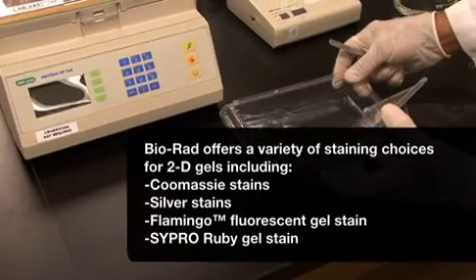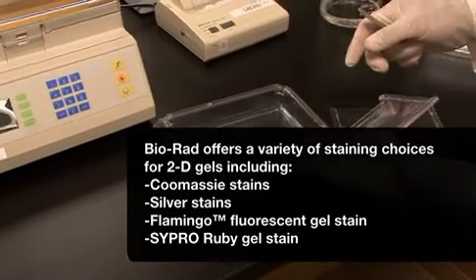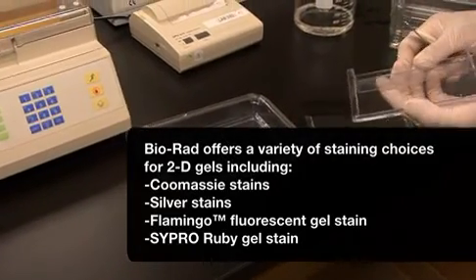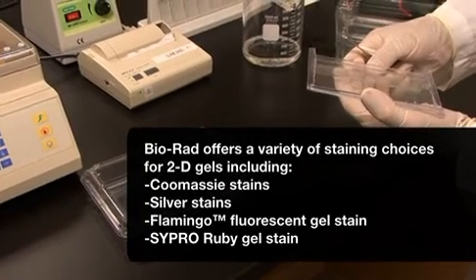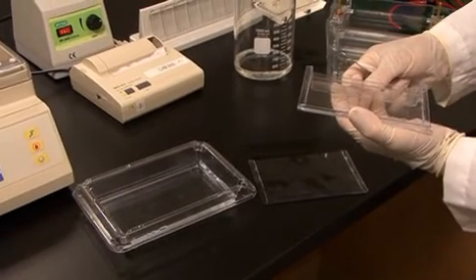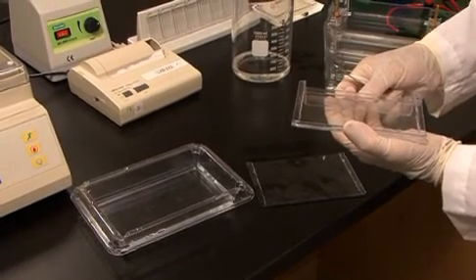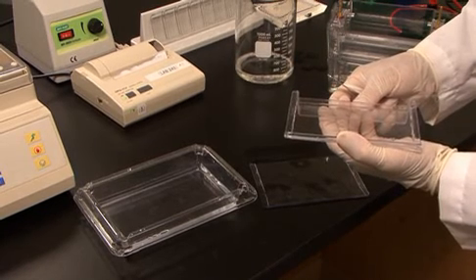Bio-Rad offers many different staining choices for 2D gels, ranging from the visual stains, the traditional Coomassie and silver stains, to the fluorescent stains, Flamingo and Sypro. In this case, I am staining this gel with Bio-Safe Coomassie. The first step requires 3 ten-minute rinses in water to remove SDS from the gel.